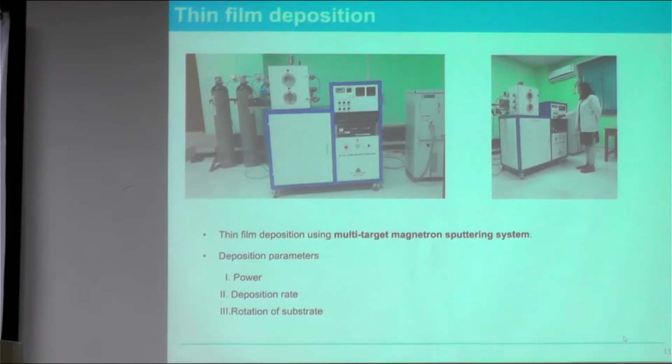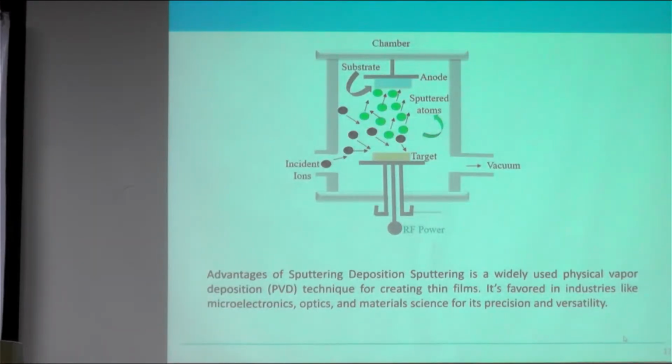So this is what I'm briefing you. You can check the deposition, and some kind of plasma as well. This is just a view graph. Now we will discuss the principle of how sputter deposition actually works.